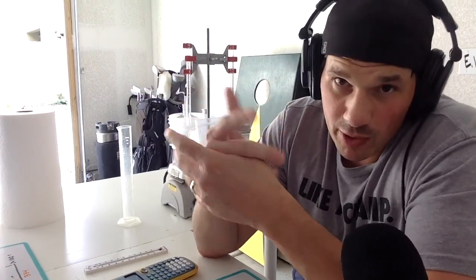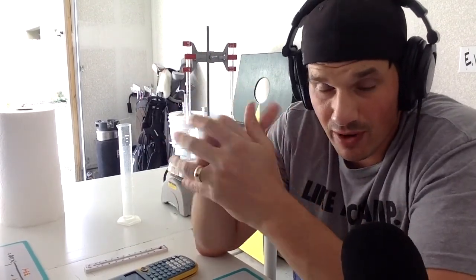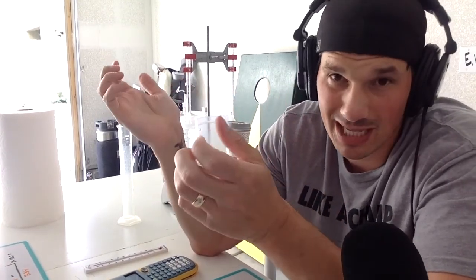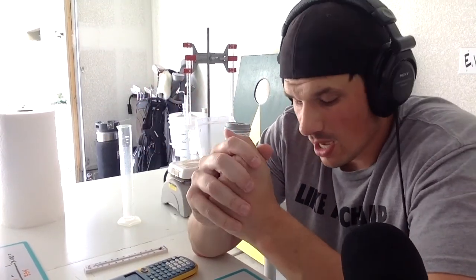Now it's negative because it was an endothermic reaction. It had to take in heat from the outside to provide heat to melt that ice. Otherwise it was exothermic. You would feel heat coming off of that styrofoam cup. Didn't happen. Cups cold to the touch mean it's taking in energy.